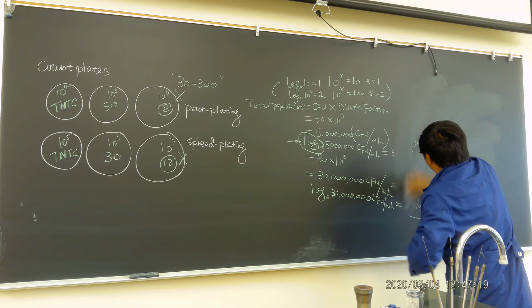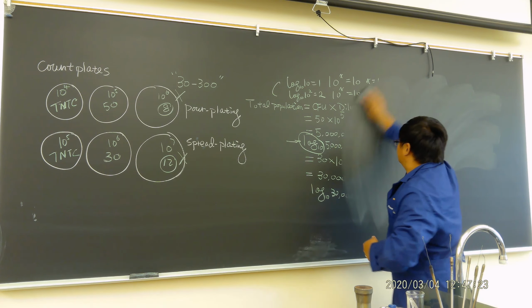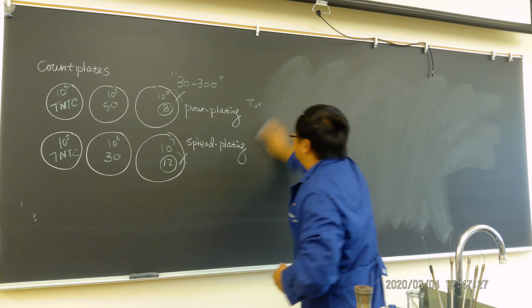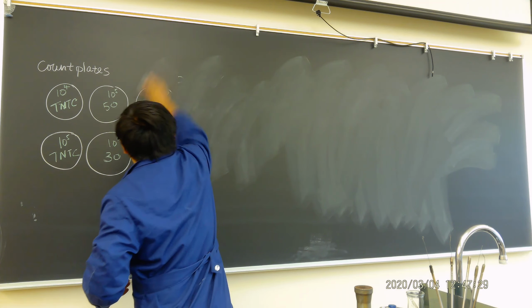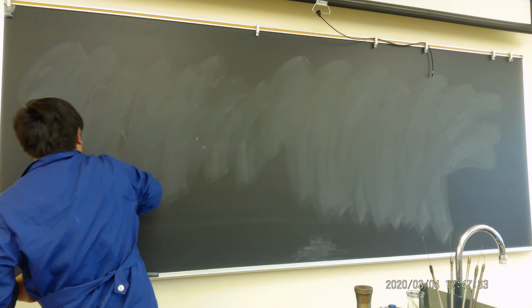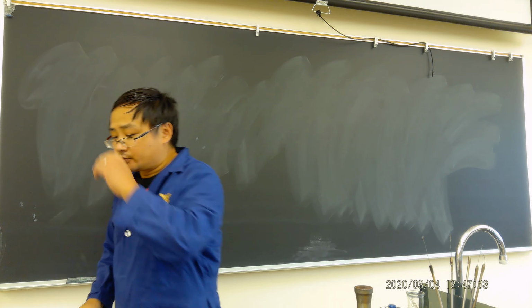Okay, so then we're going to move on to today's work. Today we're going to do two jobs. Number one is bacterial media. Number two, we will look at the impact of temperature on bacterial growth. I think these two are very interesting and very important work to do.